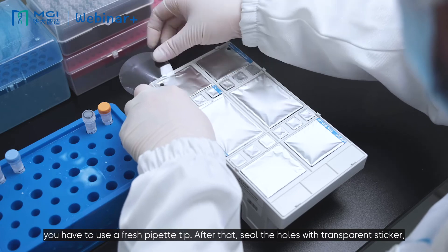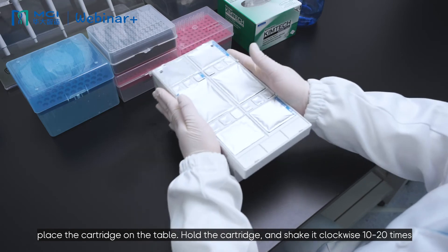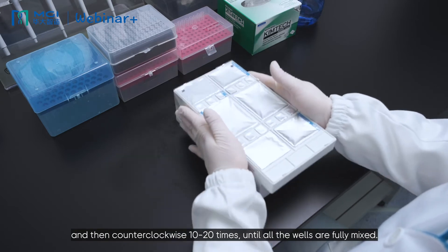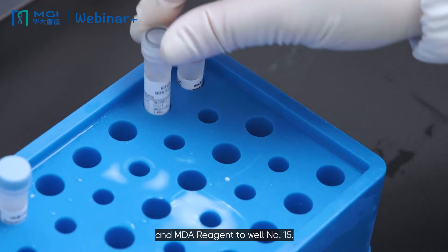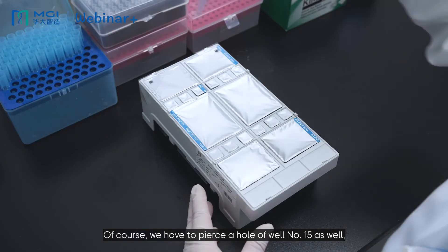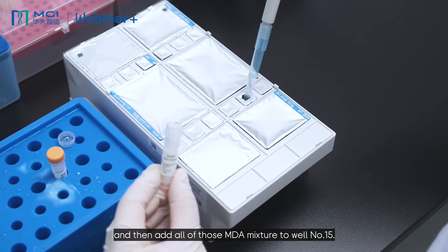After that, seal the holes with a transparent sticker, place the cartridge on the table, hold the cartridge, and shake it clockwise 10 to 20 times and then counterclockwise 10 to 20 times until all the wells are fully mixed. Since it's PE sequencing, we need to add MDA enzyme and MDA reagent to well number 15. Don't forget to vortex and spin it. Then transfer 200 microliters of MDA enzyme mix to the MDA reagent tube. Invert the complete tube several times, then pierce a hole in well number 15 and add all of the MDA mixture to well number 15.